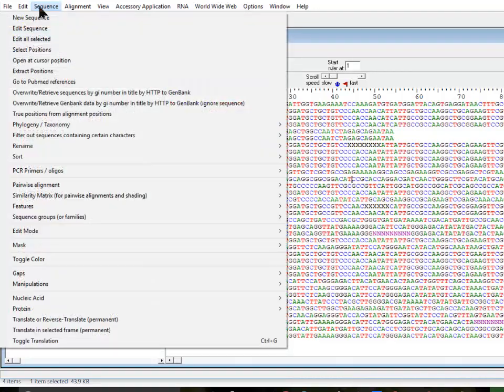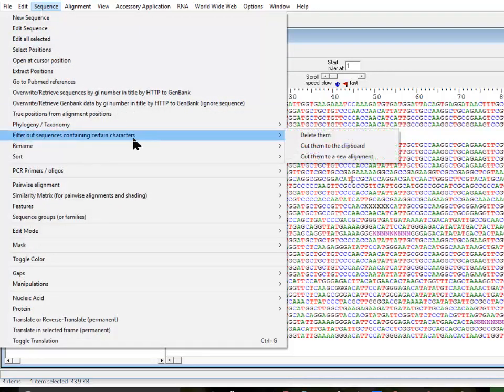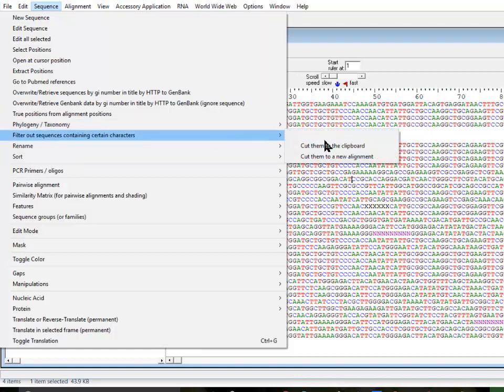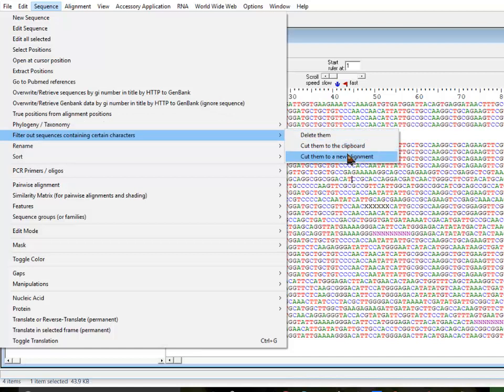One of the options we have is to filter out sequences containing certain criteria under the Sequence option. You have the option to either delete them or cut them to the clipboard or cut them into a new alignment. I'm going to use cut them to new alignment so we can see the effect of our action.